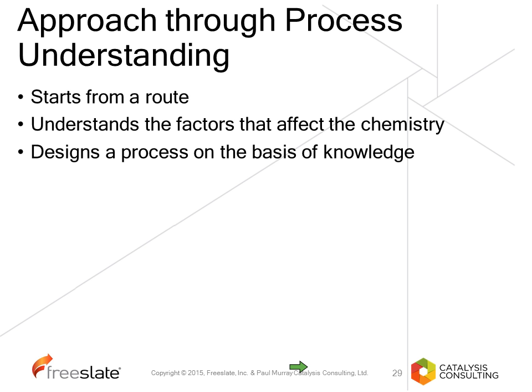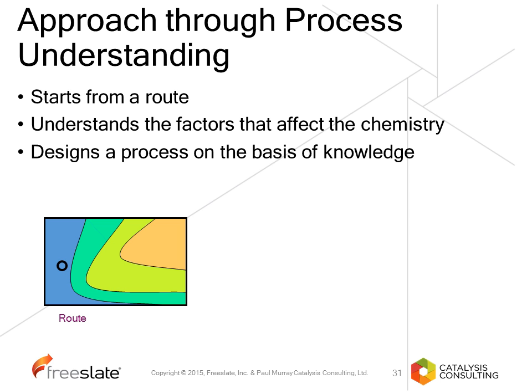So if you look at this through trying to understand the process, you still start at the same point. We still have to have an experimental point to start from. But instead of changing one factor and then another factor and then another factor, we start with the experimental design and we change multiple factors simultaneously, and we look at high and low levels for those. We very quickly rule out the factors that are unimportant and understand which ones are important and in what range.